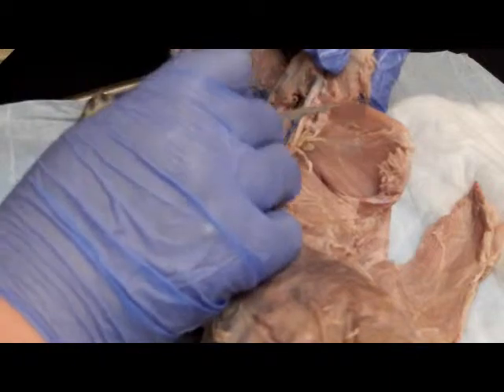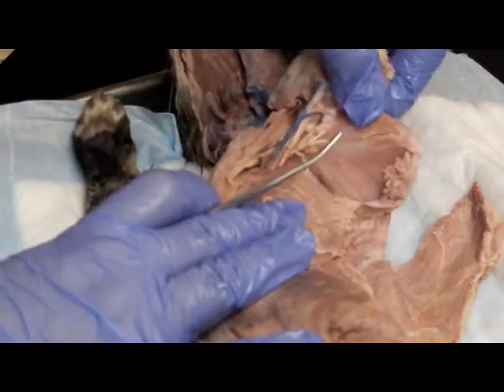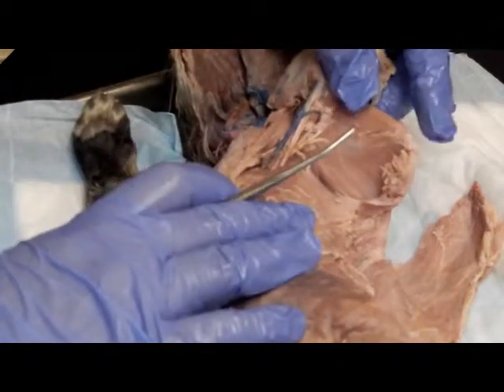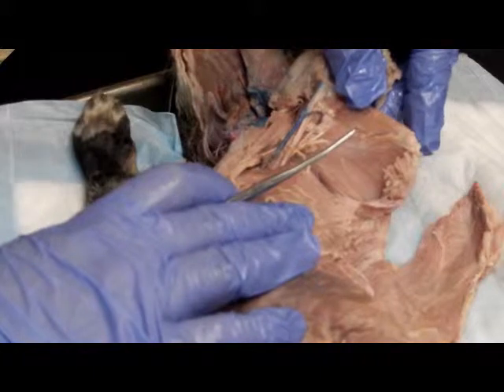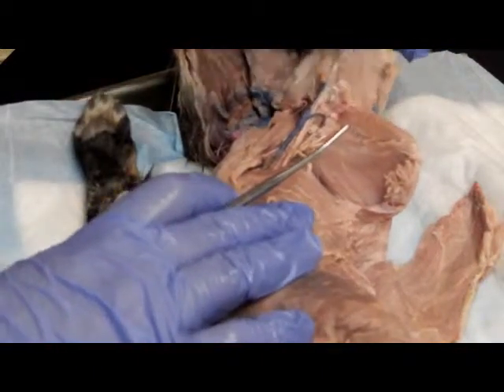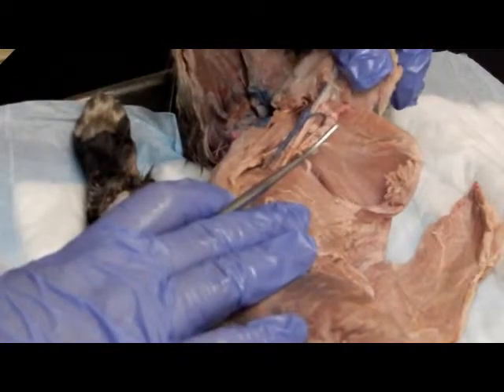This is the teres major. Its origin is the posterior surface of the scapula at the inferior angle. Its insertion is the crest of the lesser tubercle on the anterior side of the humerus. Its function, it extends, medially rotates, and adducts the humerus. It's a synergist of the latissimus dorsi.